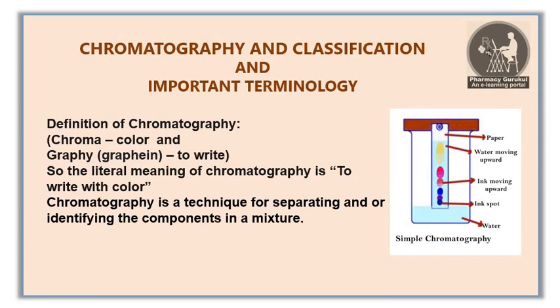Chromatography is an analytical technique commonly used for separating a mixture of chemical substances into its individual components so that each component can be thoroughly analyzed. The basic principle for this process can be briefed as: first, the sample mixture is dissolved in a fluid that may be gas, solvent or water.